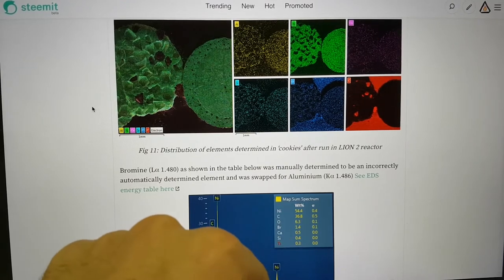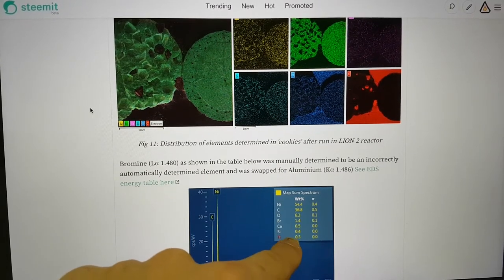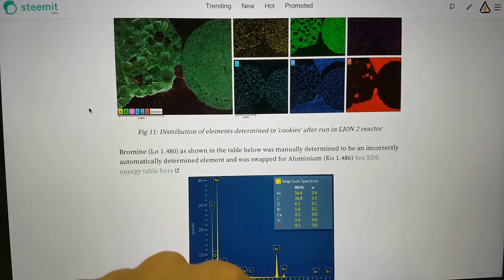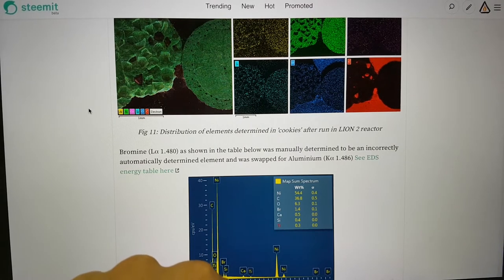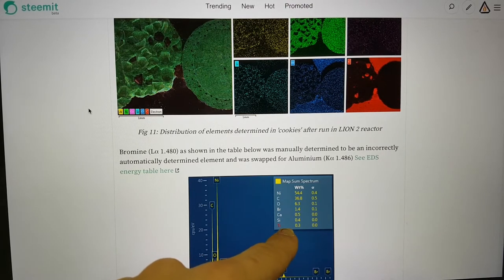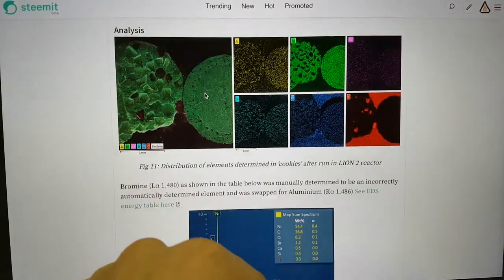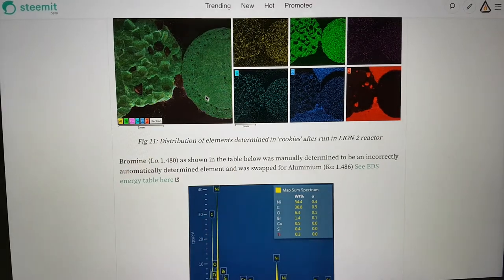The aluminum you can see is seemingly sprinkled over the chips. The calcium similarly, although there's no incidence of calcium on the background. Same with the silicon. So we have silicon, aluminum and calcium apparently determined other than the nickel, carbon and oxygen that was started with. Also, just below the threshold of determination is 0.3 here of titanium, but you can see the clear peak here.